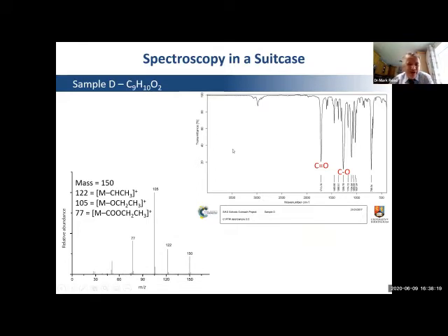We've got a more complicated molecule. We've got 9 carbons, 10 hydrogen. We now have 2 oxygens. So do they have the same environment, or are there 2 different environments for an oxygen? Well, when we look at the infrared, neither of those oxygens can be present as an OH group. We do see the strong peak again at 1,700. So one of them is definitely a carbonyl.